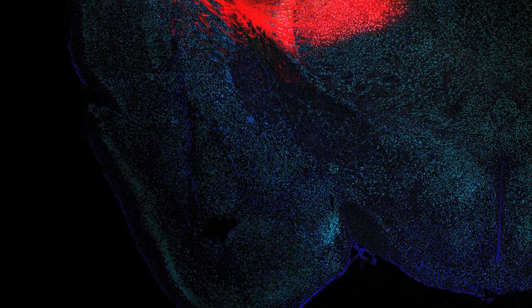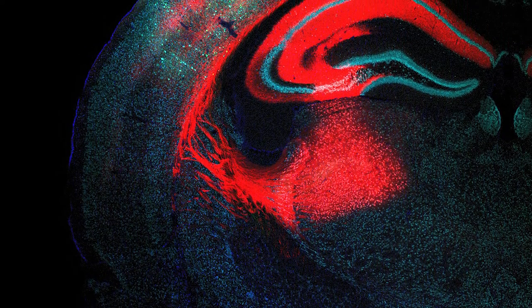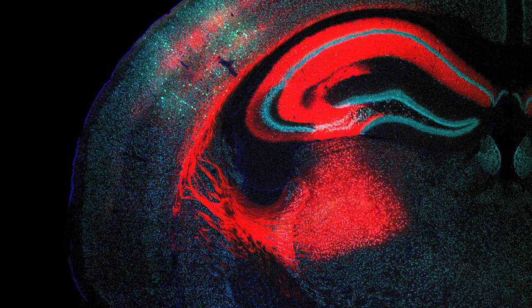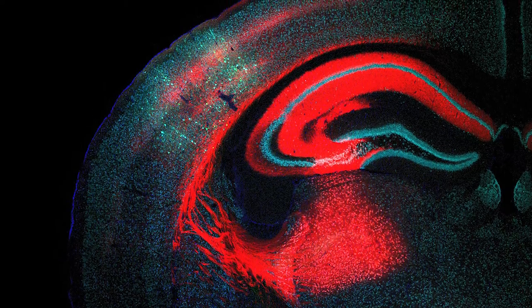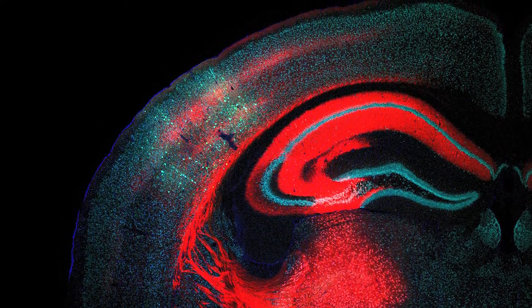In my project, what we do is label the cells in a circuit-specific manner. That means we inject in some place and the dye has to travel to another place, and only when the two different things we injected meet, there's fluorescence. We were trying to see the astrocytes in a circuit-specific way.